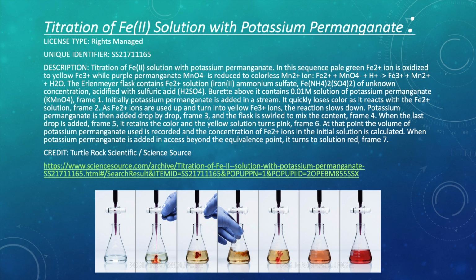I added this picture that I saw on the professor's PowerPoint, and I went ahead and looked at the link, which I'm gonna definitely put in under the description so you can go check it out. But I think this is the most accurate and just perfect picture to show what we're gonna be doing today. So if you see the last picture where you see the red solution, that is past the endpoint, and then the picture to the left where we see our yellow-red solution, that would be our endpoint.